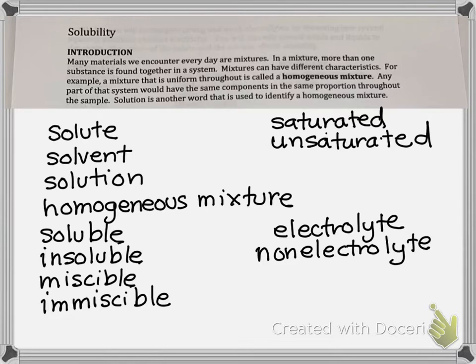and finally the rule that you might want to review is like dissolves like, which really in one form or another answers most of the post-lab questions. And we'll talk a little bit more about it when we get to that section. So let's start the lab and take a look at the data that was collected.